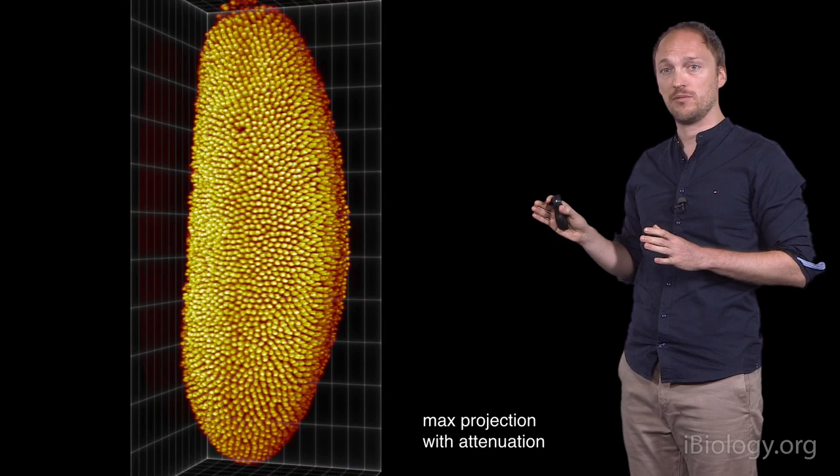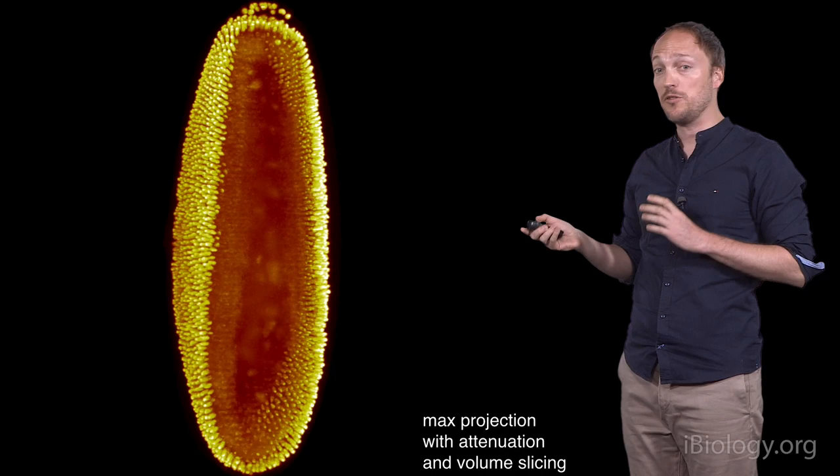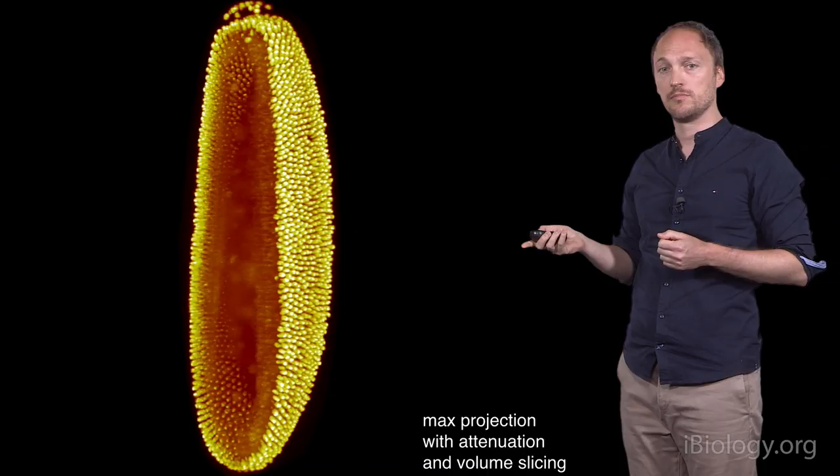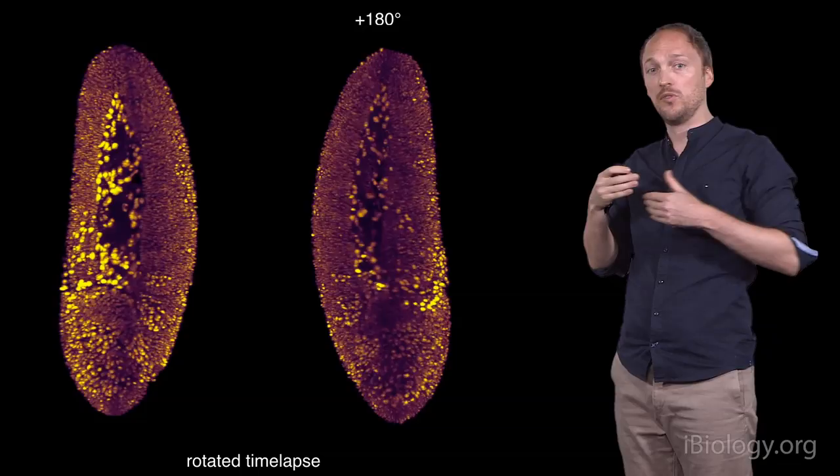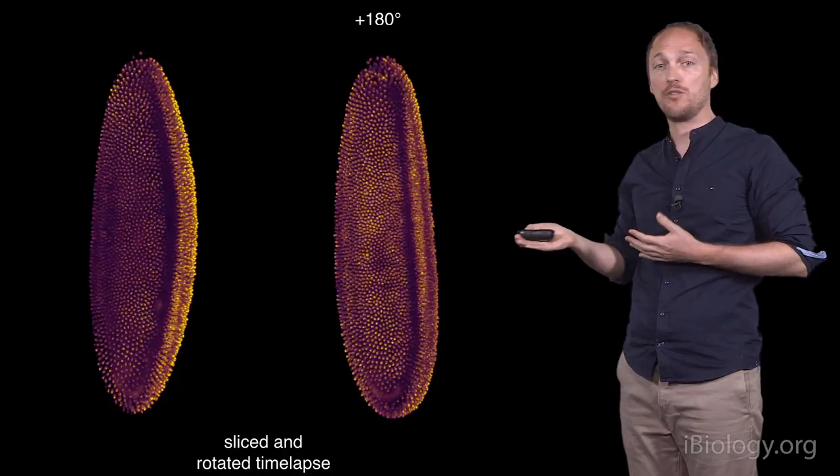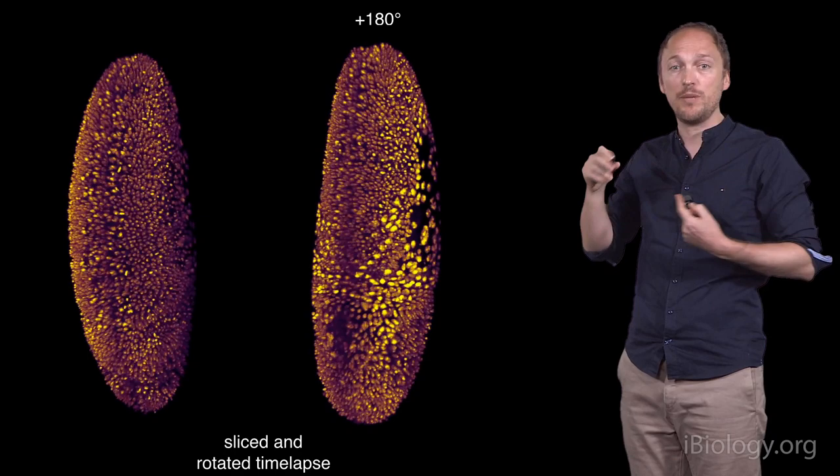Here is the result of rendering with max projection and attenuation. Structures on the surface are easier to discern. We can also slice the 3D image to see the interior. Time-lapses can also be visualized and combined with rotation. Here you can see two views that are 180 degrees relative to each other, with time-lapse playback. We can also combine all of these aspects together, rotating and slicing the dataset, while playing back the time-lapse.